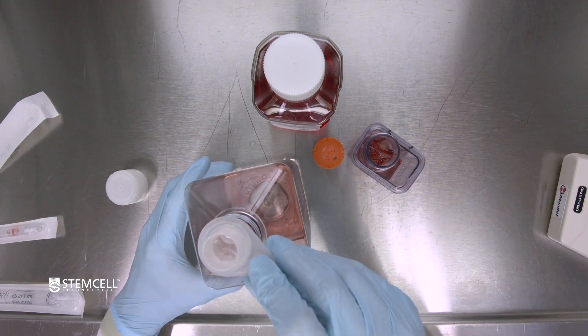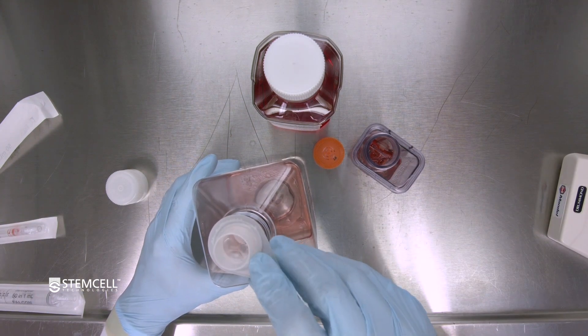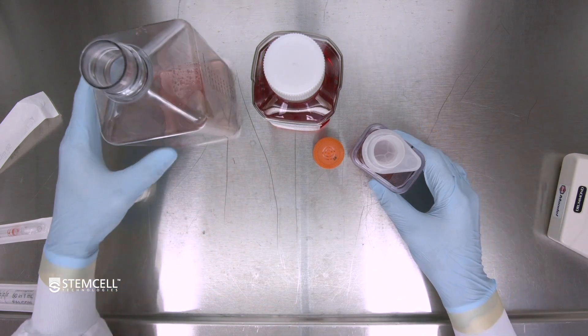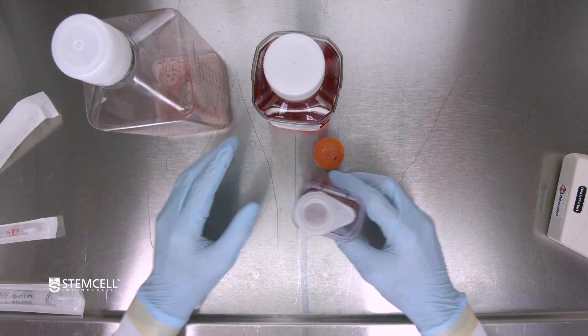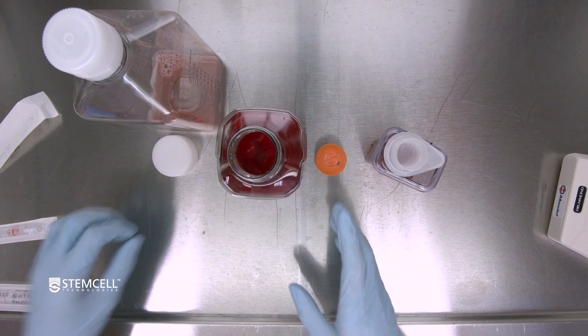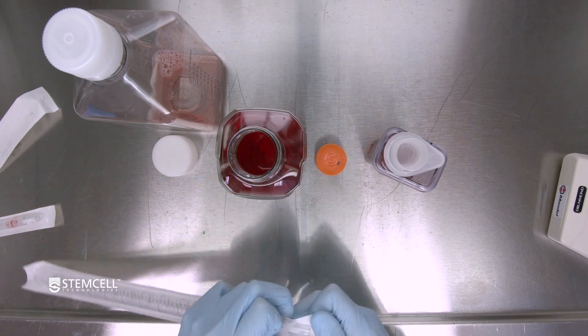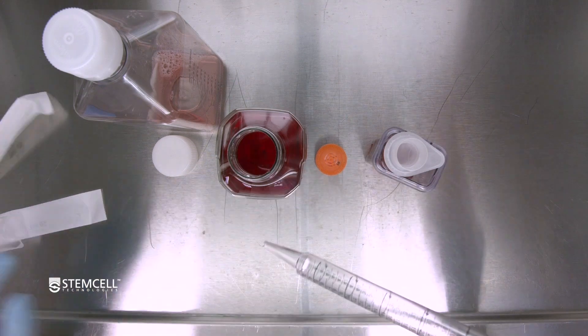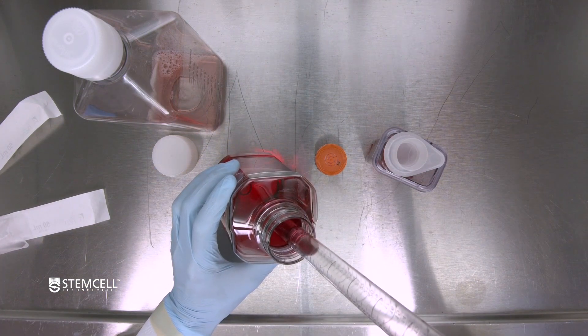Once all the media is discarded, flip the filter back onto the bioreactor vessel so that the aggregates collected on the filter are now on the bottom side. With a new serological pipette, aspirate 40ml of fresh media and gently pass it through the filter.